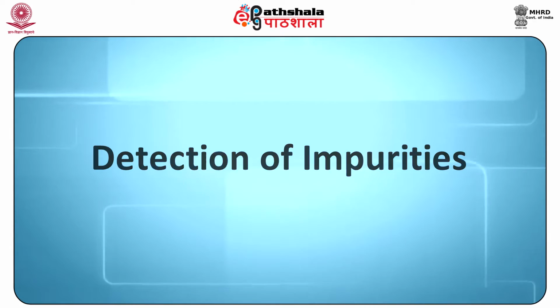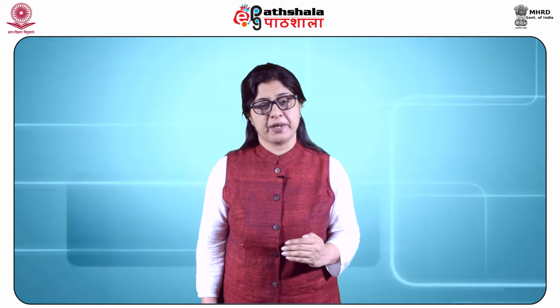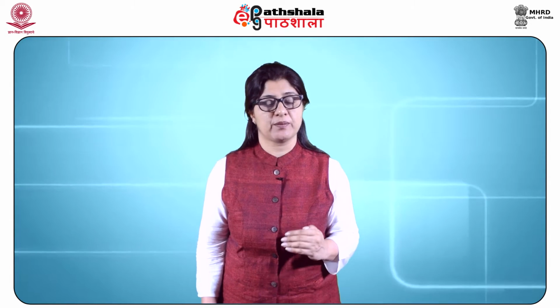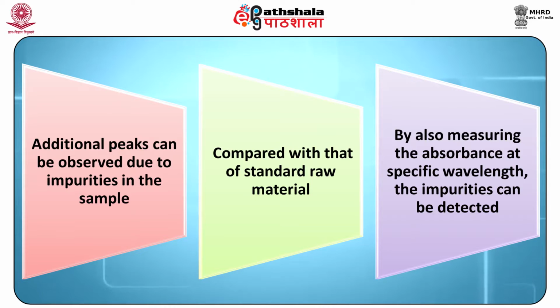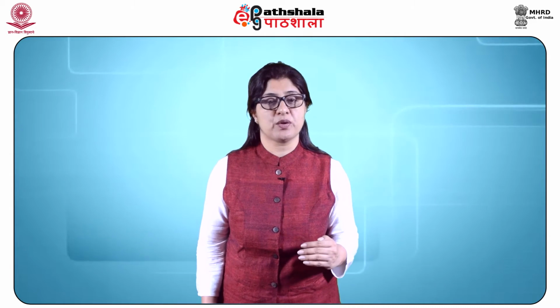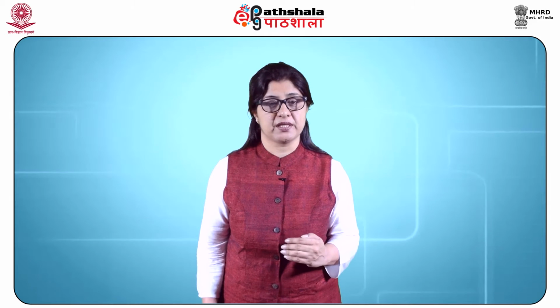Detection of impurities. UV absorption spectroscopy is one of the best methods for determination of impurities in organic molecules. Additional peaks can be observed due to impurities in the sample, and they can be compared with those of a standard raw material. By also measuring the absorbance at a specific wavelength, the impurities can be detected. Benzene appears as a common impurity in cyclohexane. Its presence can be easily detected by its absorption at 255 nanometers.